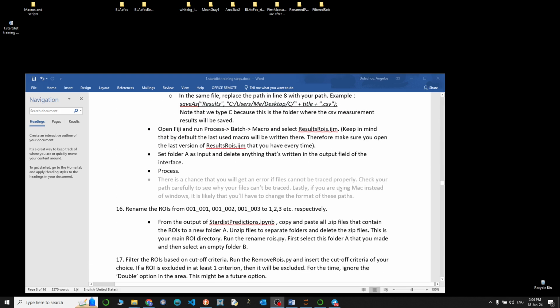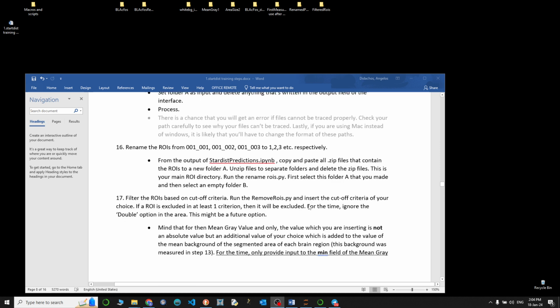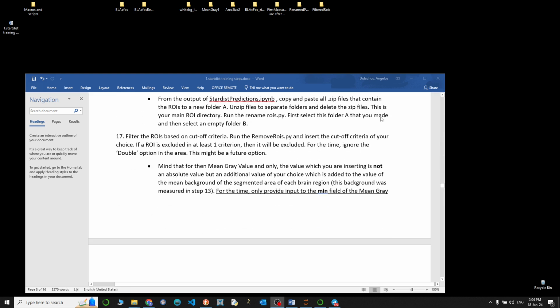Step 17. Let's see what we have to do here. This is a bit more to read in terms of content because there are many things taking place in this step. But let's try to go step by step.